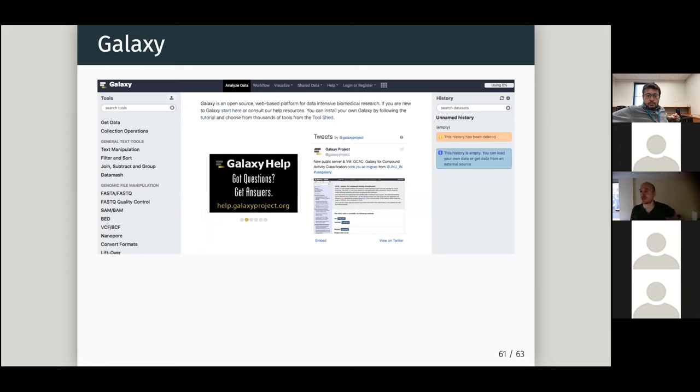Is there anything you want to add, Olivier, or others that have questions, comments? No, I mean, to go back, someone said that they tried to assemble a bacterial genome. What assembler do you recommend to use for bacteria? Or any other assemblers will work?